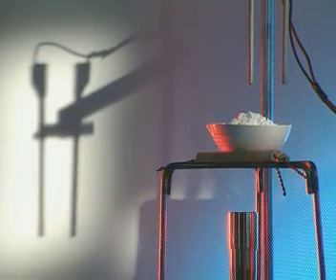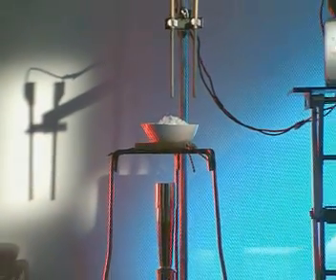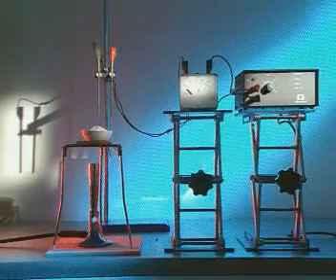You can split a compound using electricity. The idea is to pass an electric current through it, a process known as electrolysis.